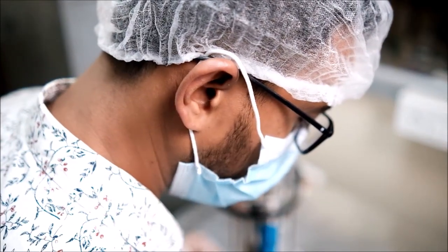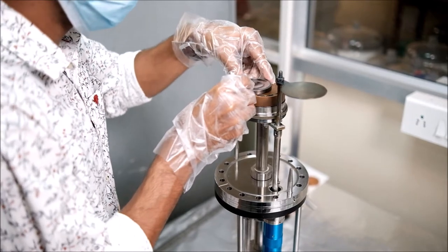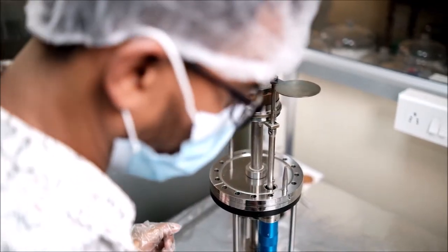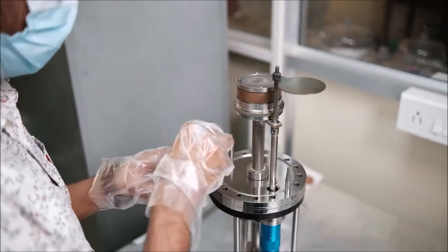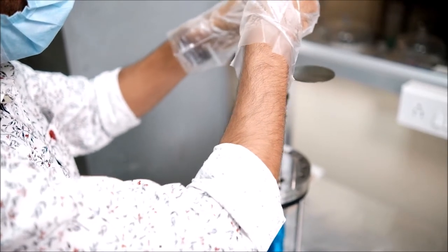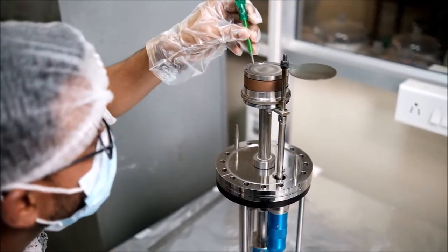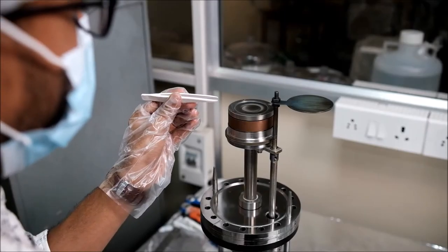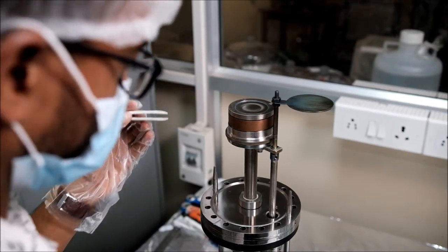I have attached the back plate and will take a tungsten target for demonstration purposes. With the help of the groove we will attach it, and then with the help of this gasket and screw we will attach it. While tightening the screw we should be careful not to tighten it too tightly, and we have to check whether it is uniformly tightened all over the disk area.